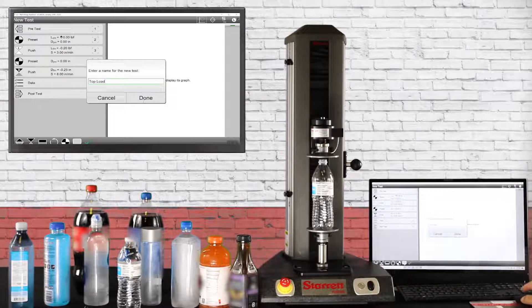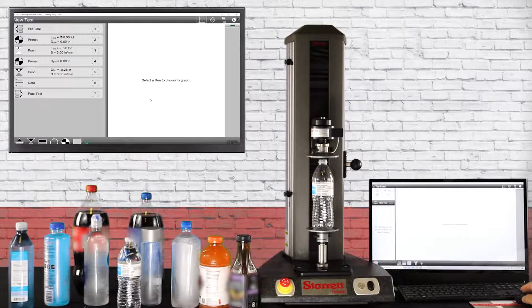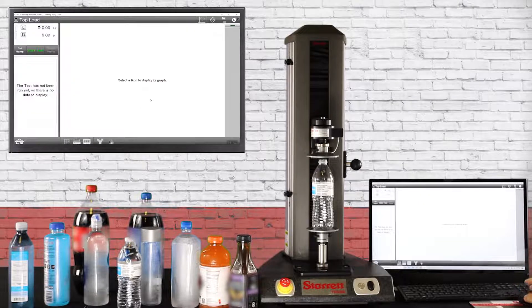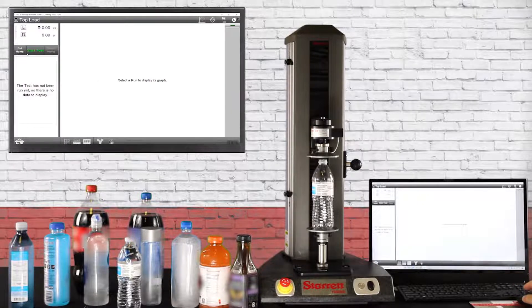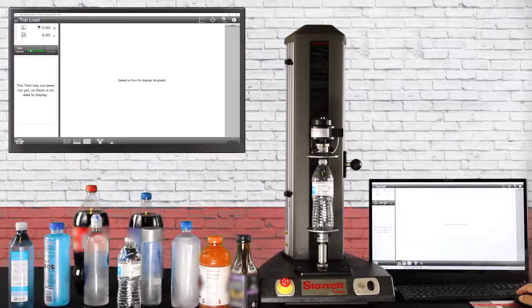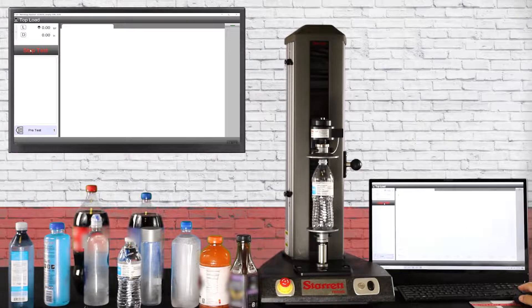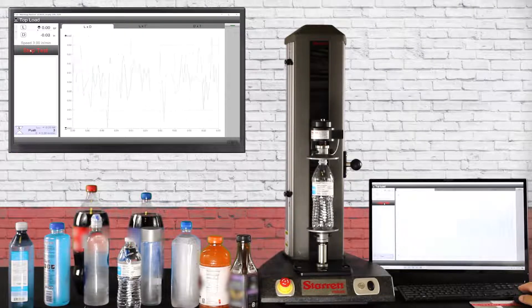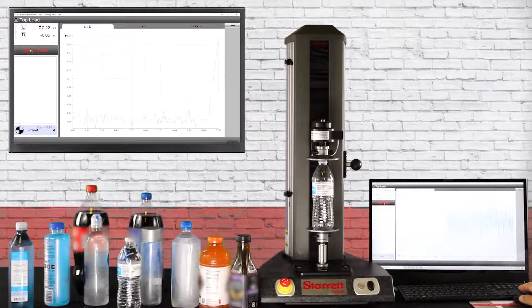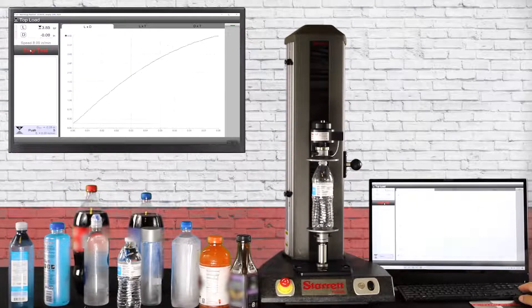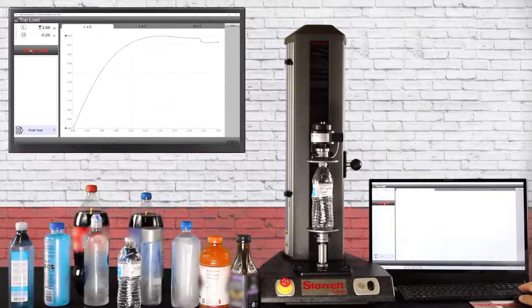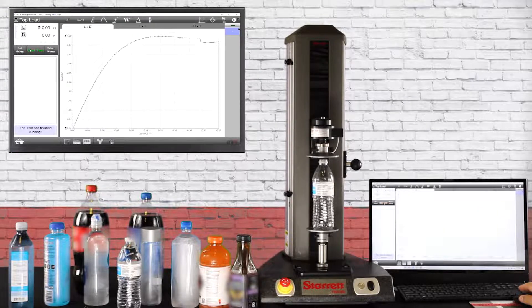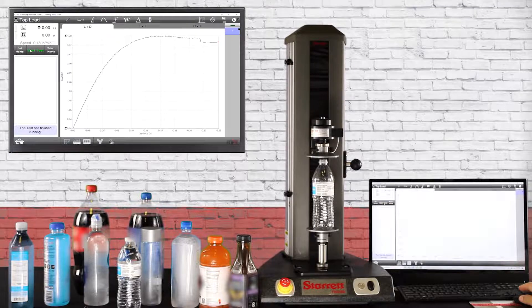Now let's go run our test so we hit start test. You can see the crosshead coming down, almost touch the top of the bottle, boom there it touches, there's our test. Come back up and there we go.